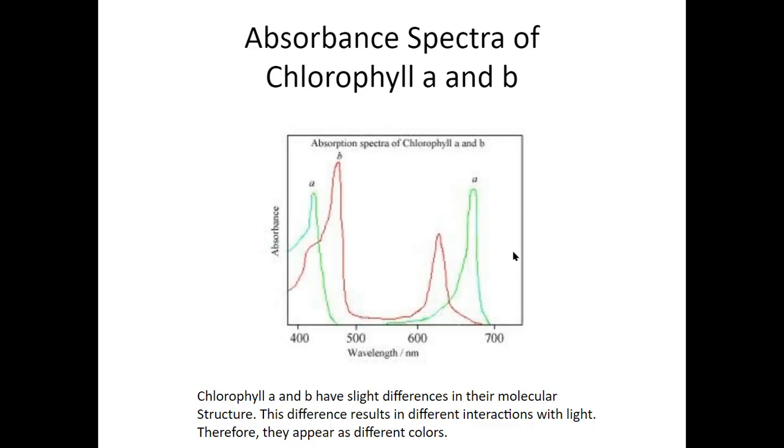And so you'd have to work with leaves and pull the chlorophyll out, and then you just run this through, and you can get the absorbance values of standards and look at the concentration of chlorophyll in your samples, and that can give you an idea of how much you've got there. So it's a real neat little experiment.